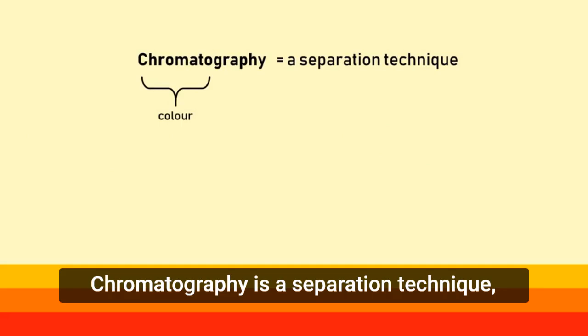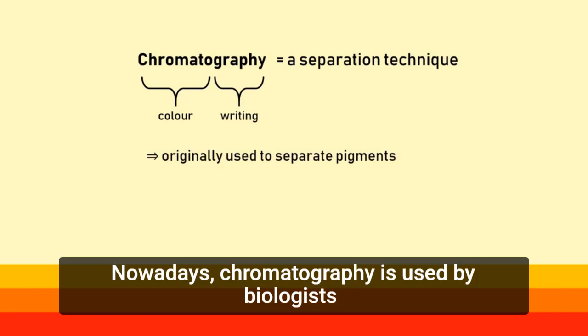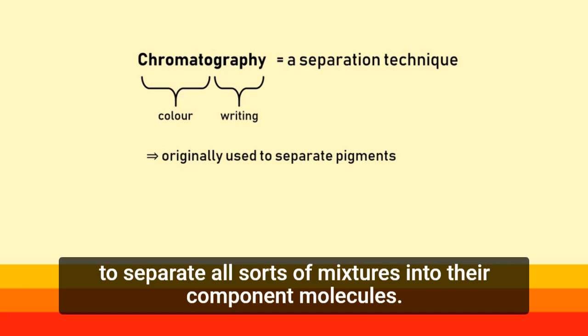Chromatography is a separation technique so named because it was originally used to separate pigments of different colours. Nowadays, chromatography is used by biologists to separate all sorts of mixtures into their component molecules.